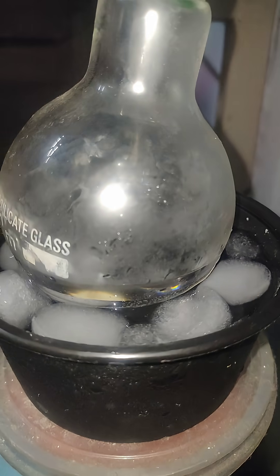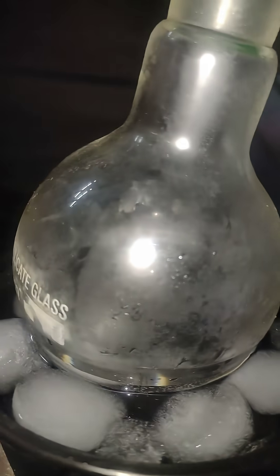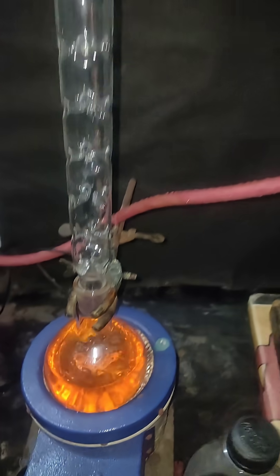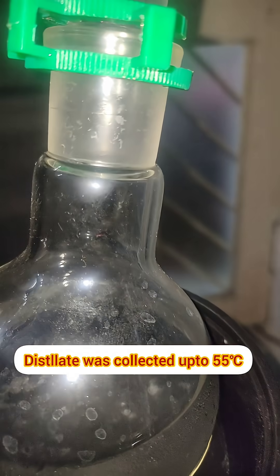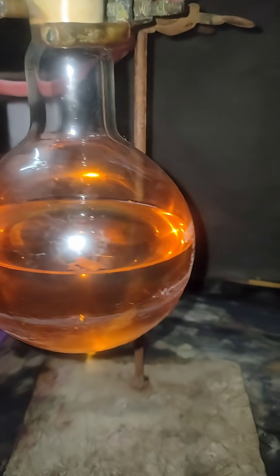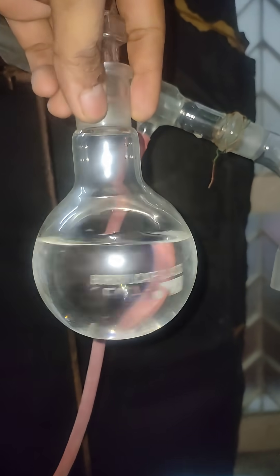This is a 250 ml flat bottom flask — sorry, round bottom flask — and this is a 500 ml flask. We have collected this much petroleum ether and it's still distilling off the remaining petrol. The distilled petroleum ether is around 250 ml.